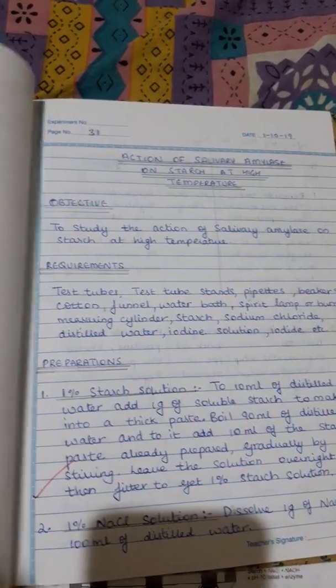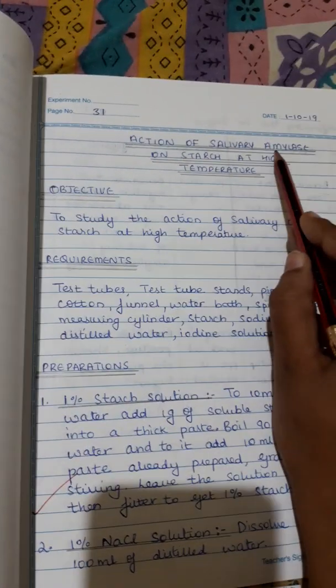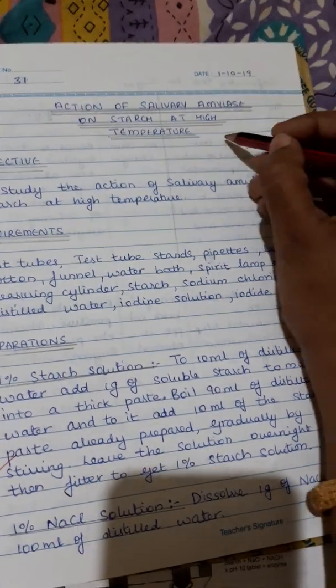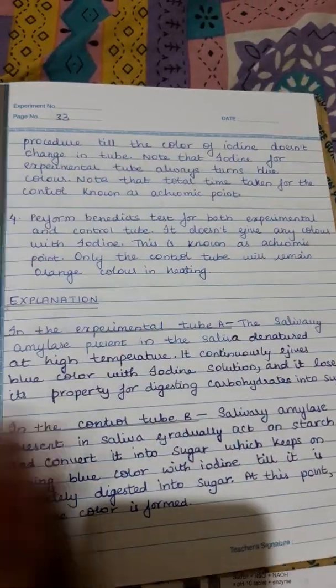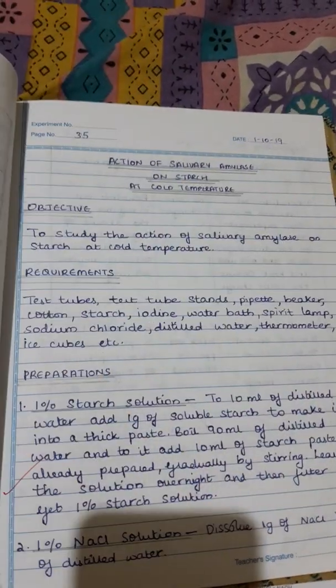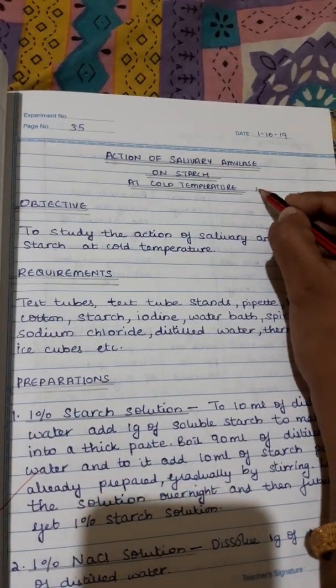Then it's a big one. Then 5B, action of salivary amylase at high temperature. Then this activity at cold temperature, that is 5C.